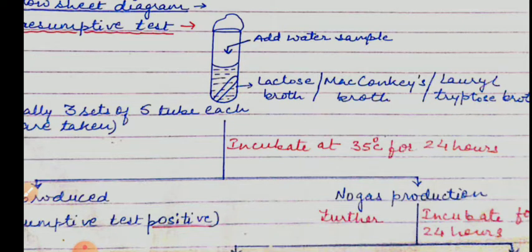In actual practice we have to take 3 sets. Each set contains 5 tubes. That means 3 sets make 15 test tubes. In the first set of 5 tubes we take double strength broth. In the second set of 5 tubes we take single strength broth, that is 9 ml, and in the third set of 5 tubes we take 9.9 ml of single strength broth.